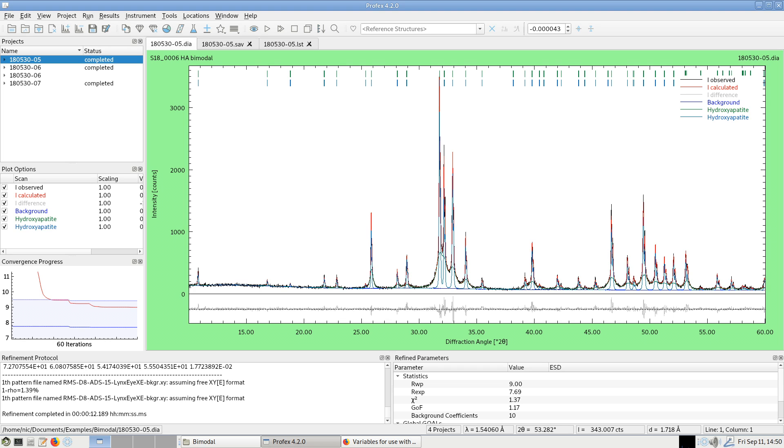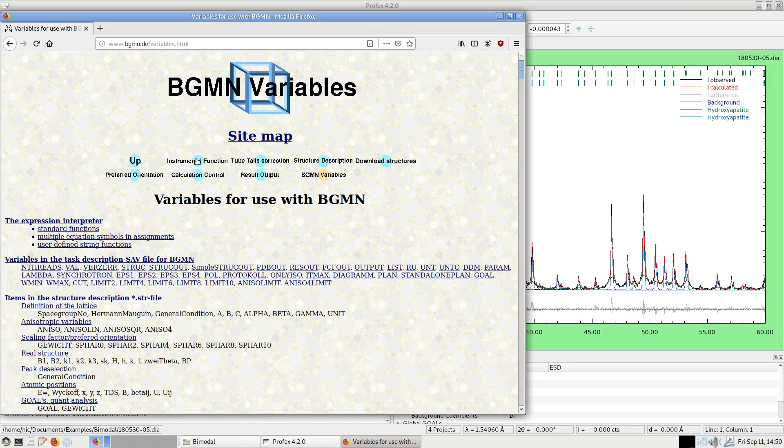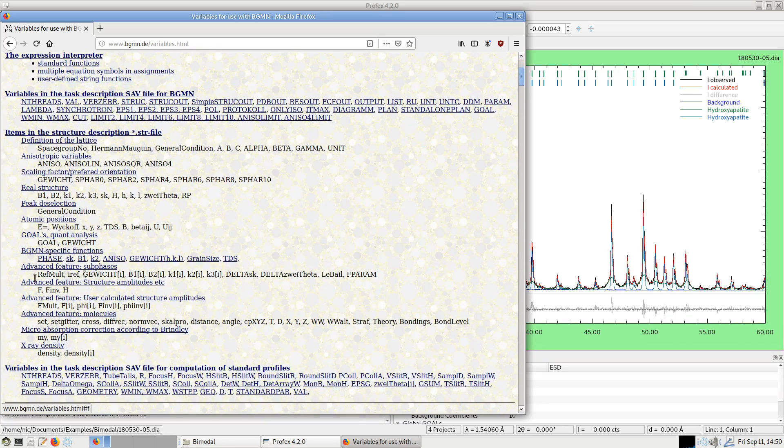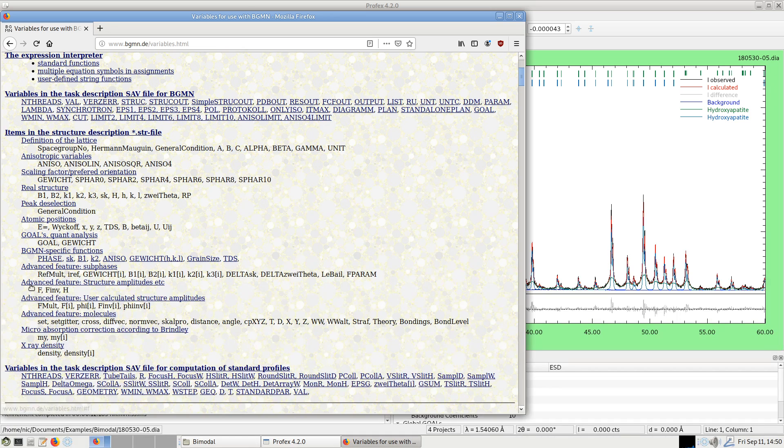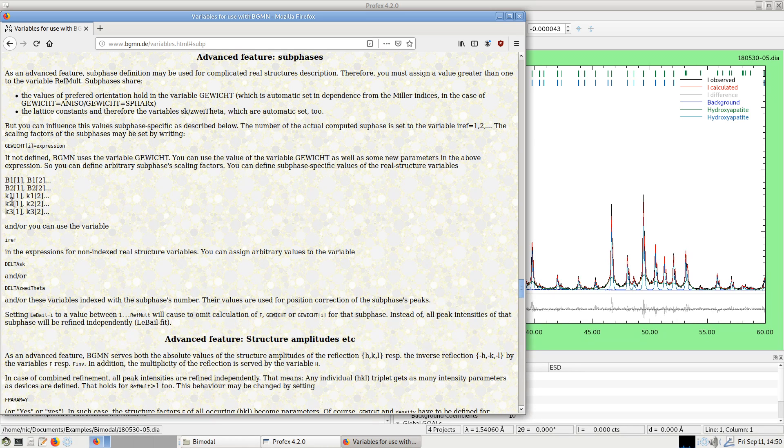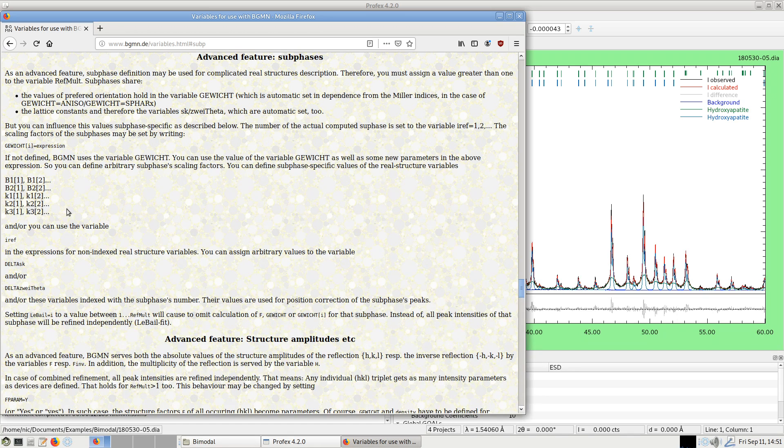There is a better solution to refine two separate phase fractions and it uses the subphase feature of BGMN. If we go to the BGMN website, bgmn.de/variables.html and scroll down to the section Advanced Features Sub-Phases here, it gives a short description of what sub-phases are. We basically can split the profile related parameters, so B1 for peak broadening due to small crystallites and K2 for peak broadening due to microstrain in separate sub-parameters.